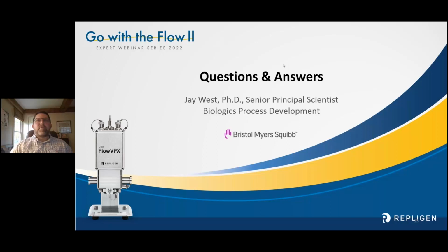I think we've done a qualification inline and pseudo at-line with the VPX. When you get the VPX, there's an adapter that basically turns it into a pseudo solo VPE, so it makes it much simpler to do a validation of a method. A qualification is similar to a validation, but not quite as rigorous.